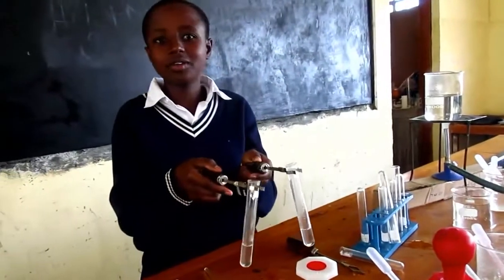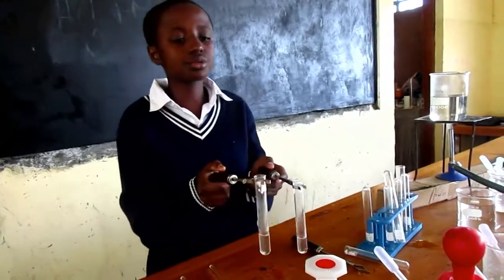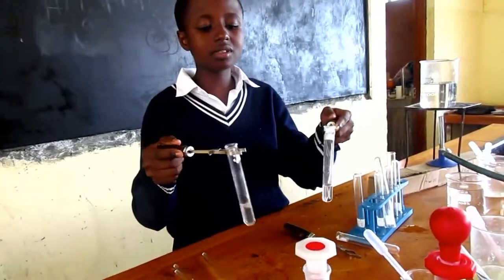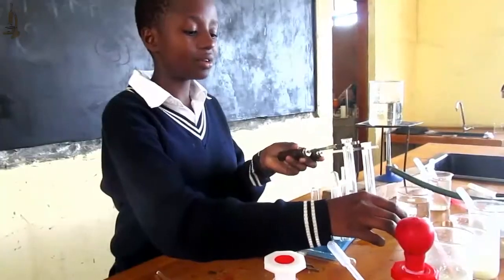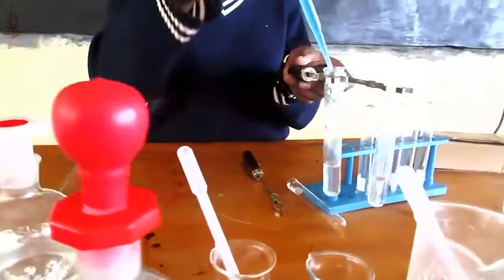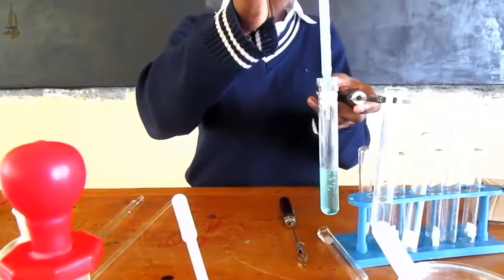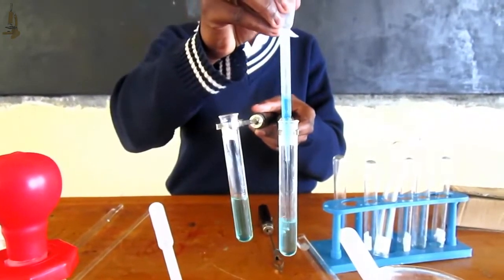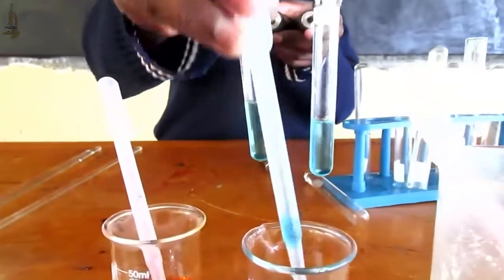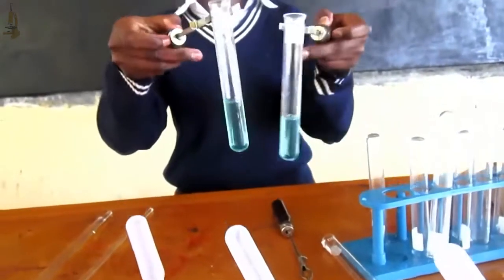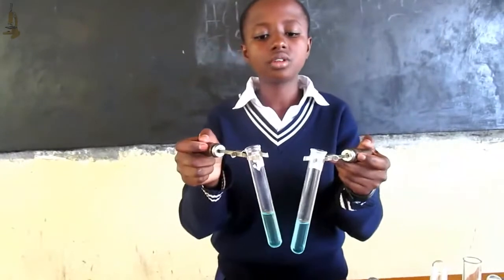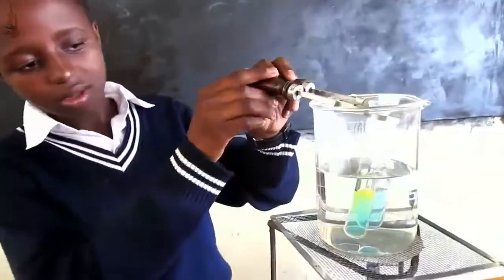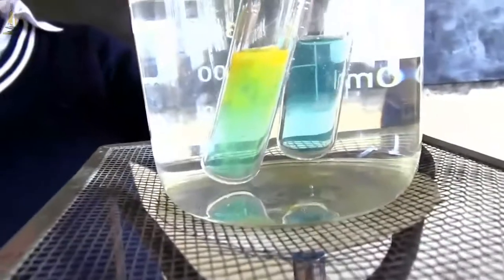After we have cooled our solutions, we add sodium hydroxide to neutralize the hydrochloric acid to salt and water. After adding sodium hydroxide, we shake our solutions so that they are mixed well. We are then going to add Benedict solution to our mixture solutions. After we have added Benedict solution, we will boil our solutions to observe for color changes — from blue to yellow.